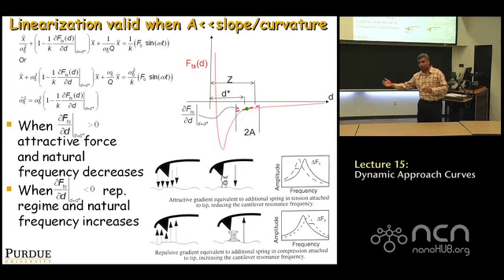And now, when we talked about tapping mode, we are again talking of an attractive and repulsive regime. What do those regimes have to do with attractive gradients and positive gradients and so on? The words attractive and repulsive have been used fast and loose quite a lot so far. I want to quickly lay out that in each case, there was a different meaning. In tapping mode, when we say switching from attractive to repulsive, our definition of attractive is simply that the net interaction force between the tip and the sample during an oscillation cycle is negative.